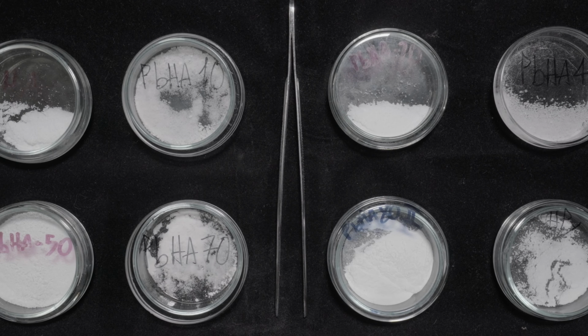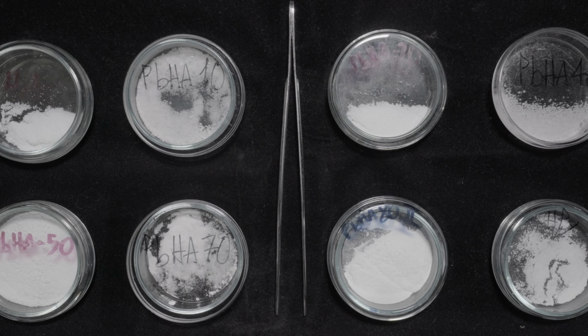Now let's go back to the lab and see some more practical activities. The following research steps are the laboratory experiments. Let's see what I planned and did. Firstly, following a scientific paper, I synthesized 7 different lead calcium phosphate compounds, from 10% to 100% of lead presence.